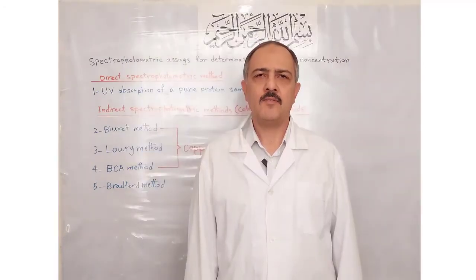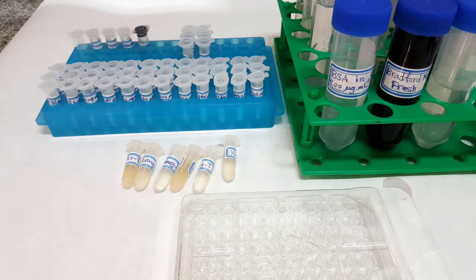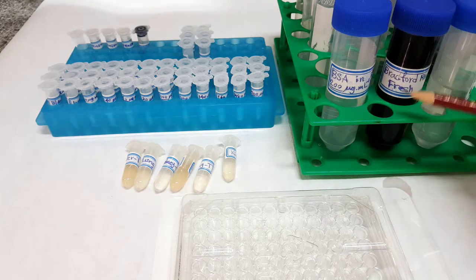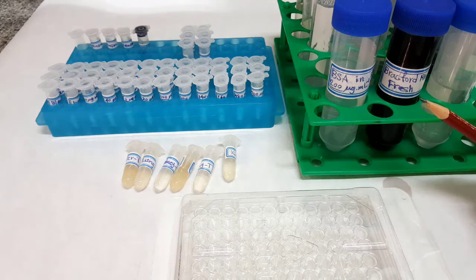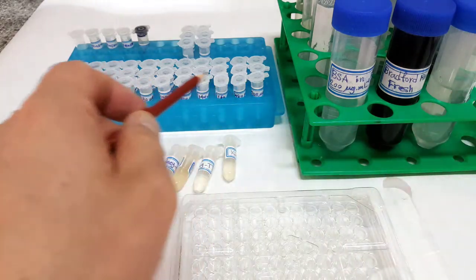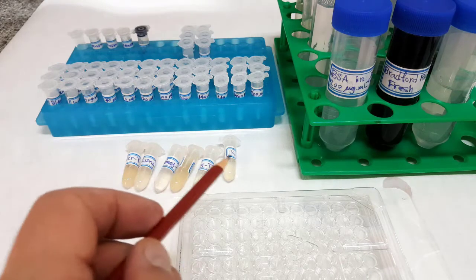Okay, now let's deal with our experiments. For measurement of protein concentration of samples by Bradford method, we need freshly prepared Bradford reagent, bovine serum albumin or BSA standards, and some samples.